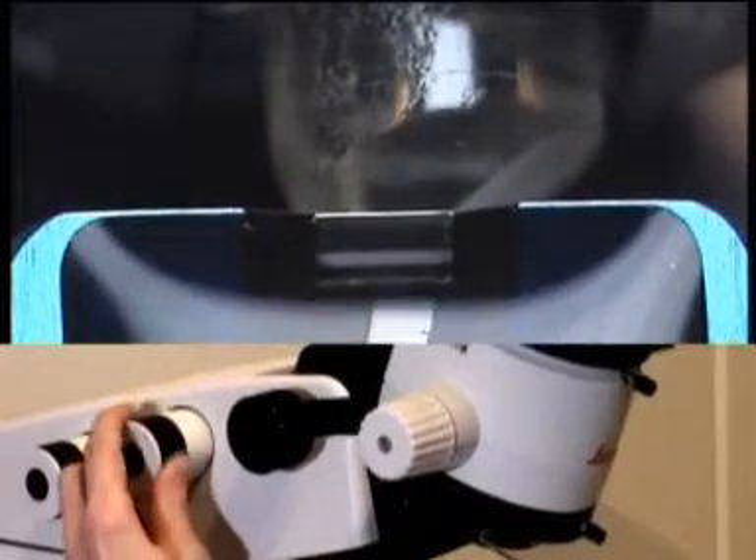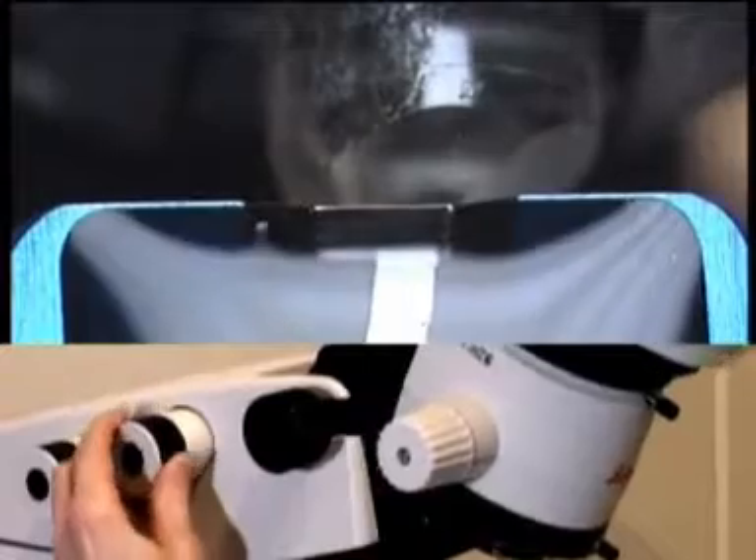For standard sectioning, the stereo microscope carrier is easily moved back to its click stop position for diamond knives or glass knives.